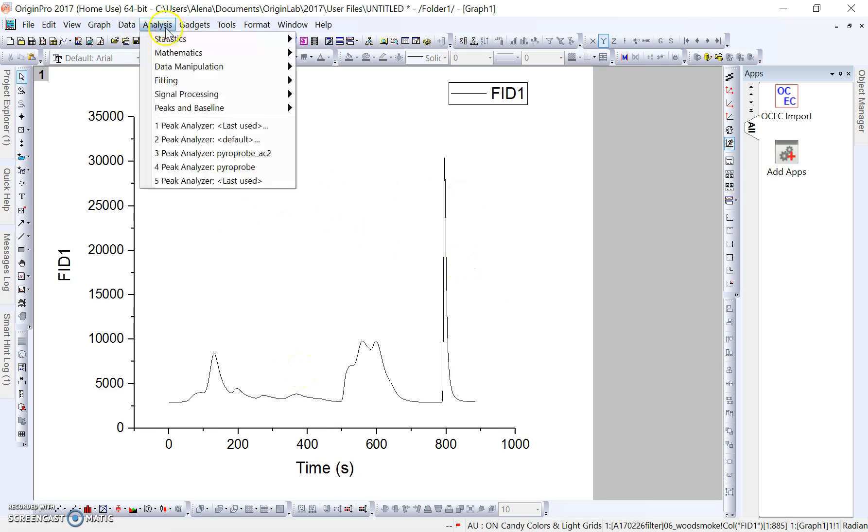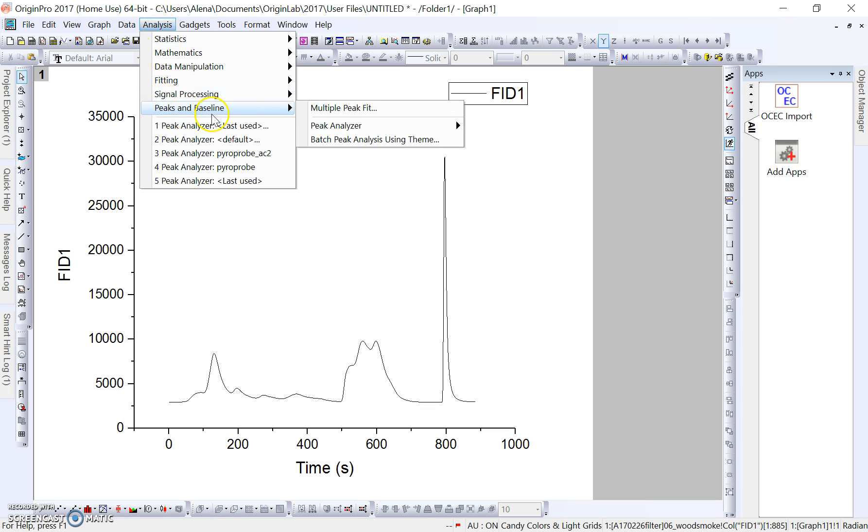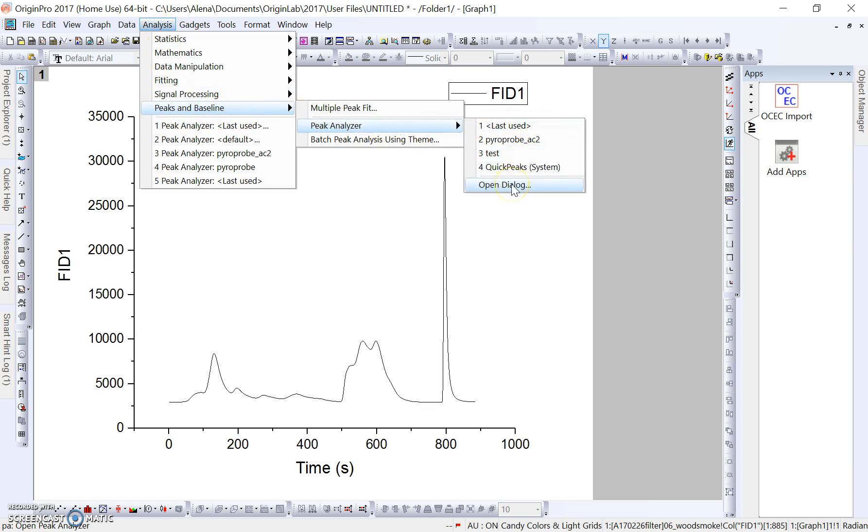To begin with the peak and to analyze our peak areas, we go into Analysis here up at the top, Peaks and Baseline, Peak Analyzer, and we're going to go Open Dialog.